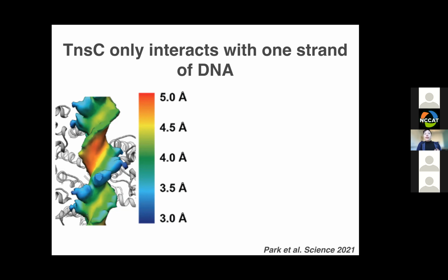What you can see is that one part of the DNA is very high resolution, and the complementing strand is of comparatively lower resolution. It was really striking because it looked like this other half of the DNA got completely smeared out. From this, we thought that if this is true, then this protein should be able to form helical filaments on single-stranded DNA as well. And in fact, this was true.